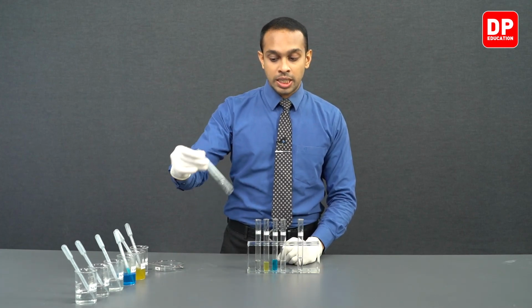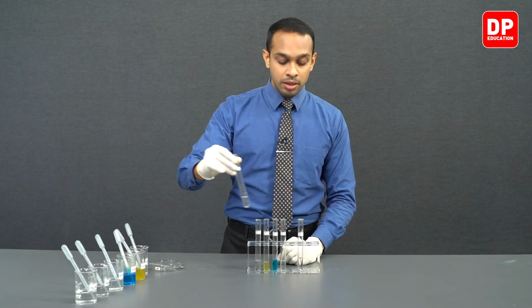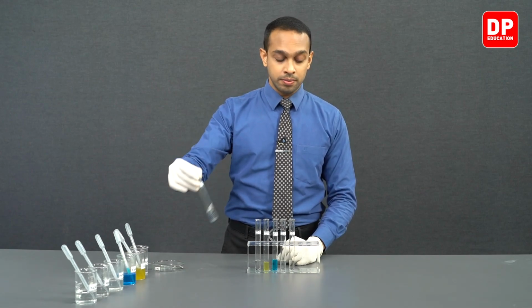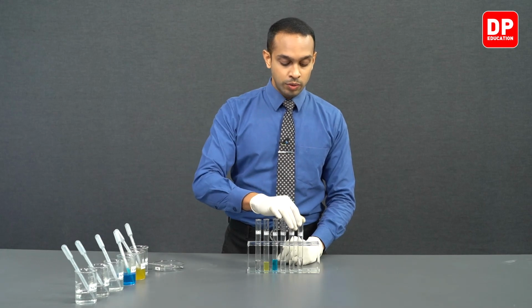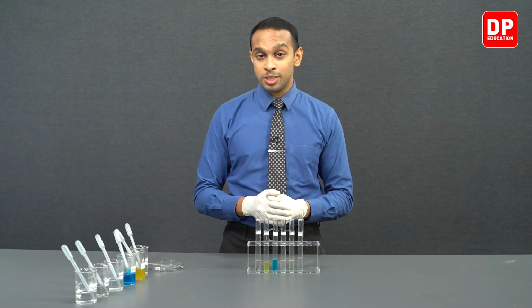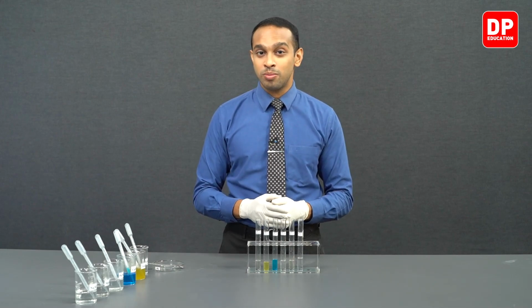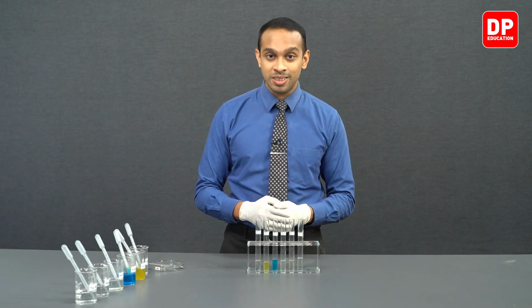At that point you will see lead metal will react with certain aqueous solutions that we have over here. So what we are trying to observe is which metal ions will get displaced in the presence of lead. So we will allow this reaction to happen for a while, and then we will come back and observe which metal ions have been displaced as solid metal in the presence of lead.